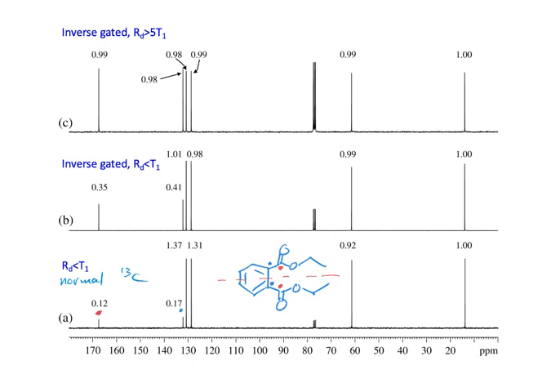So notice, even though the carbons are all 1 to 1 to 1 to 1, because there's symmetry down the middle, look at how much smaller those two quaternary carbons are. And you really can't tell the CH2s and the CH3 and even the protonated CHs are all pretty big. But the quaternary carbons are very small.